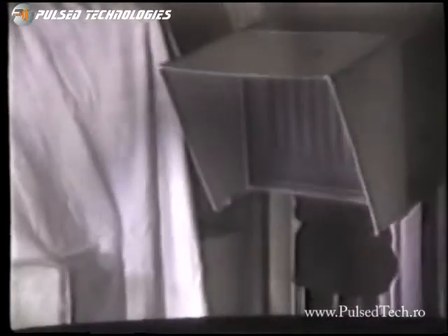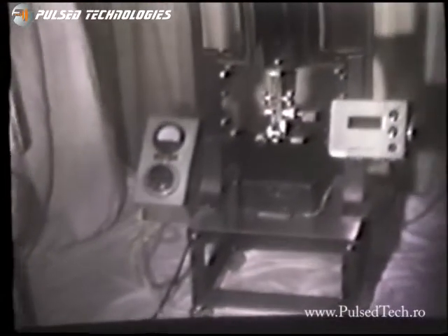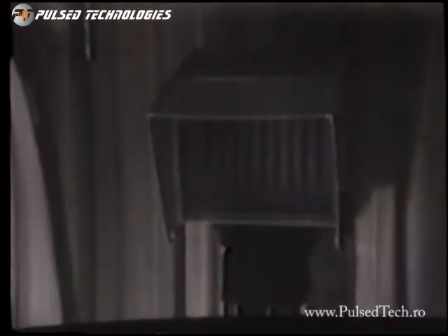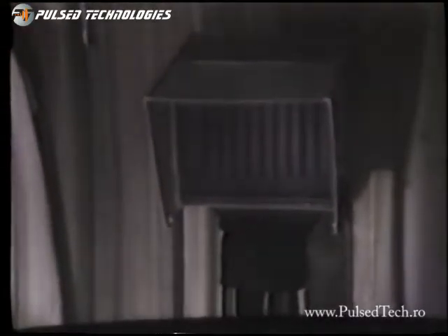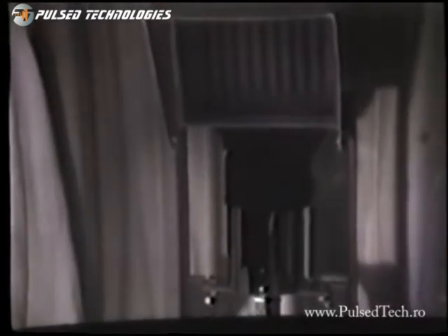One of these instruments is used in the Los Angeles area now in research. The digital control on the right, lower right, is for getting back to precision locations, up and down, vertical locations, so that slides can be put in and out and focused very rapidly.